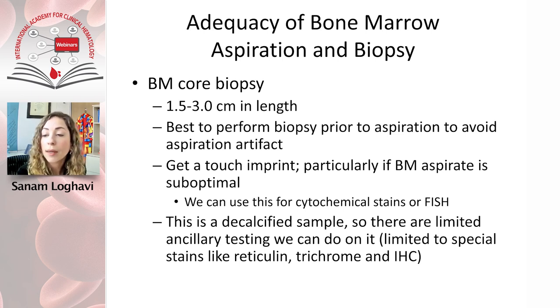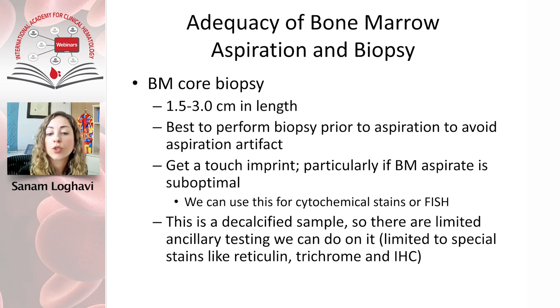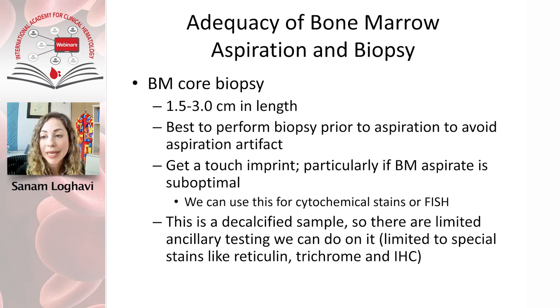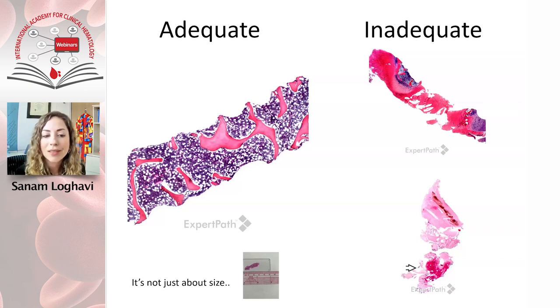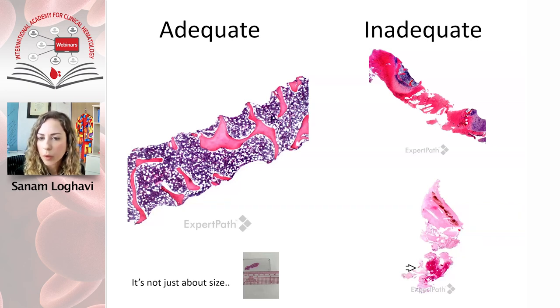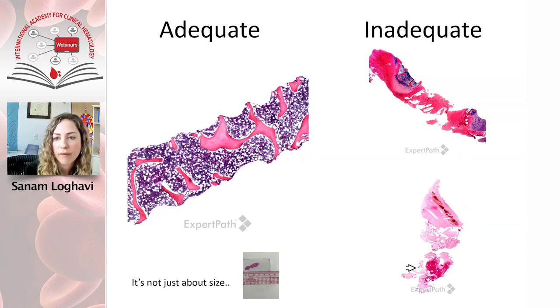Remember, the core biopsy is a decalcified specimen — we have to decalcify the bone to cut the block, which limits ancillary studies. You can't just send the core biopsy for NGS. Here are examples of adequate versus inadequate biopsies: the left-hand side is a perfect adequate biopsy — intact and long enough. The inadequate ones fail not just because of size: one is mostly blood with a little bone marrow, and another is essentially just periosteum with no marrow space available for evaluation.